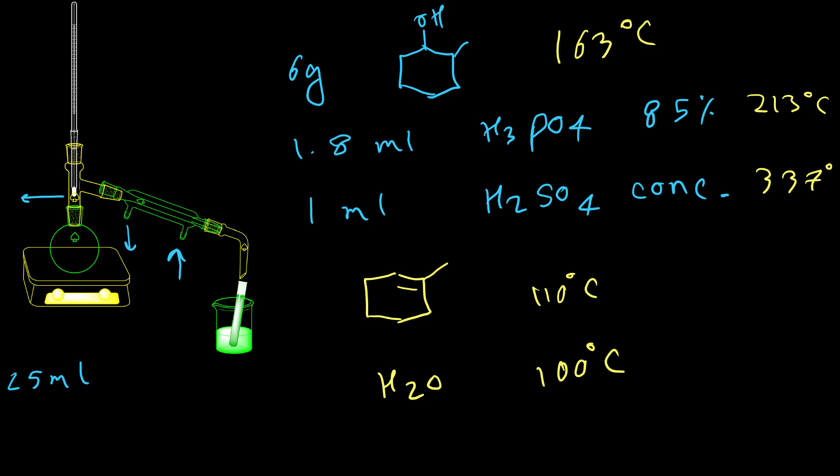So when the system starts boiling, at the beginning, the first compound that is coming should be water. We're not supposed to collect water. Removing water from the system by this way helps us to shift the reaction to the right according to Le Chatelier's principle because we're removing water from our equilibrium. When the thermometer shows 101°C, it means water is finished. Then we need to start to collect everything coming after 101°C.